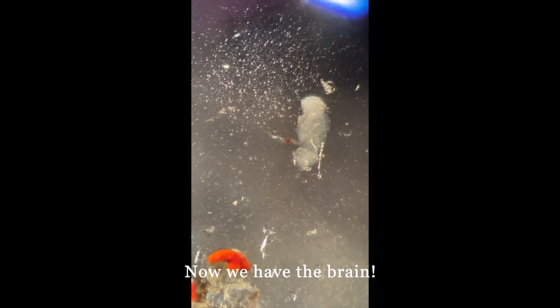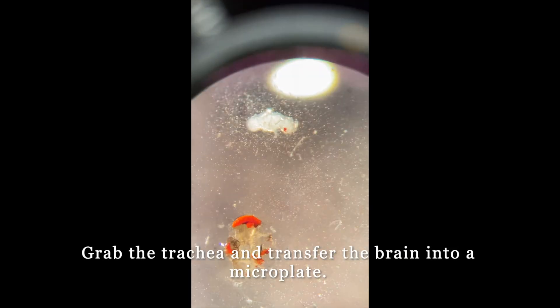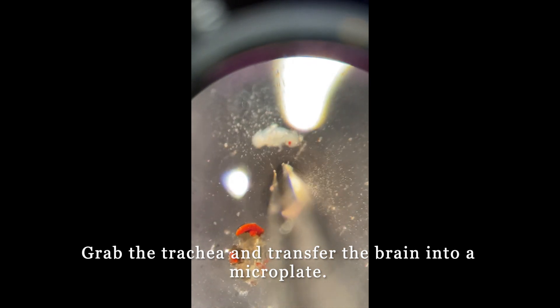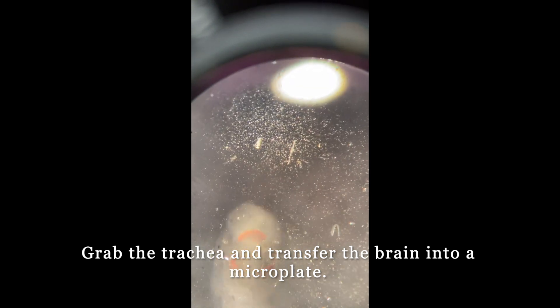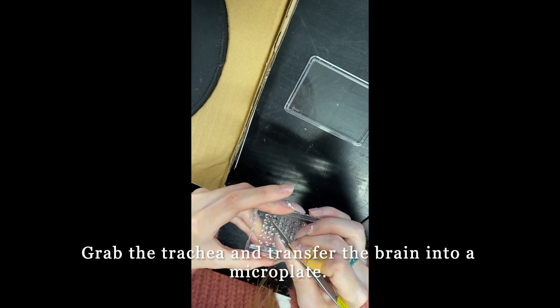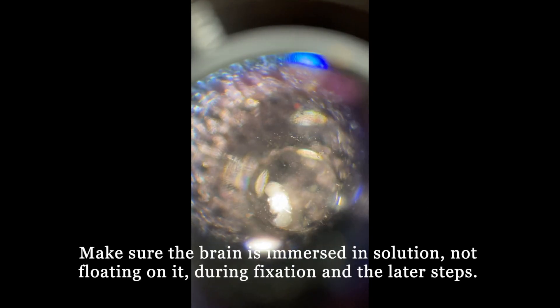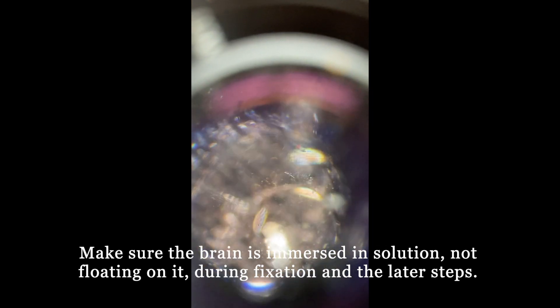Now that we have the brain, we are going to move it by grabbing the trachea and transfer it into a microplate. Put the brain into a well where we have already pipetted 7 µL of PFA solution. Make sure the brain is immersed in the solution, not floating on top of it.